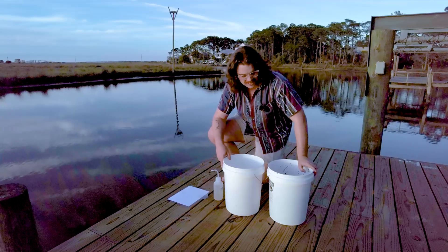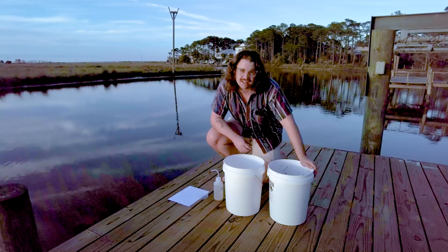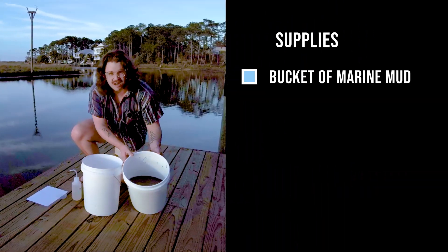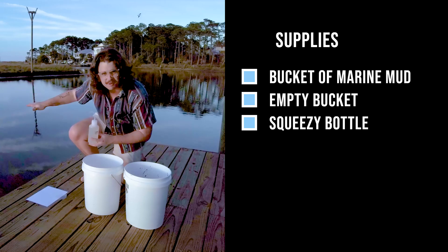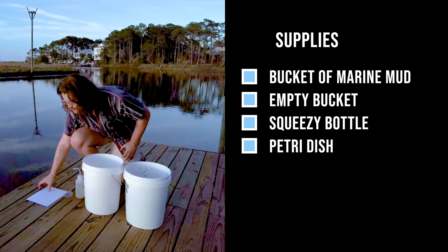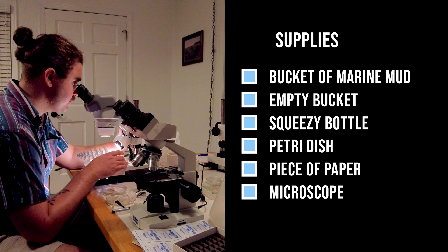Today we're back with another set of marine invertebrate collection techniques. We're going to be looking for the phylum Kinorhyncha, otherwise known as the mud dragons. The things you'll need for this are a bucket of marine mud, an empty bucket, a squeezy bottle filled with seawater — hopefully from the same area where you collected the mud — a petri dish, and most importantly, a single piece of paper. You'll also need a microscope to find these tiny animals.